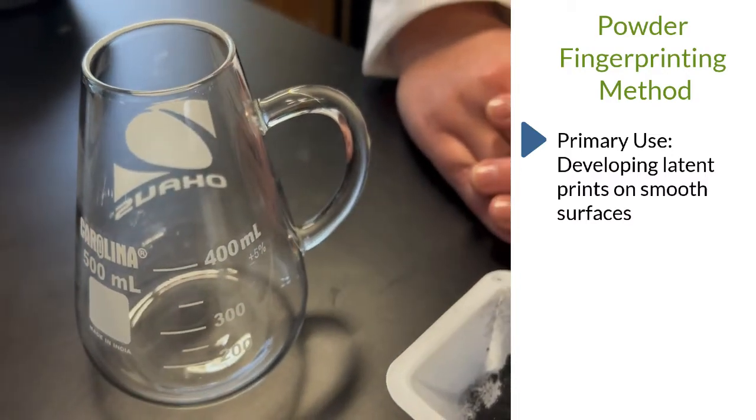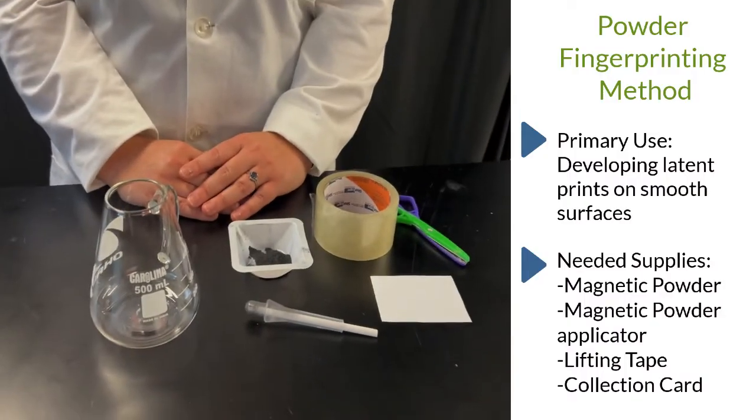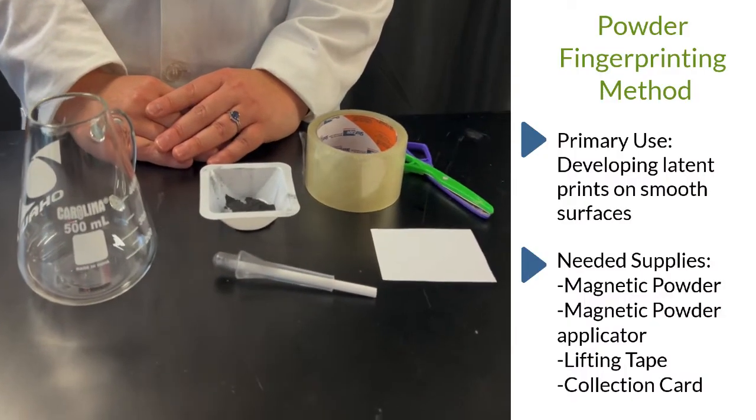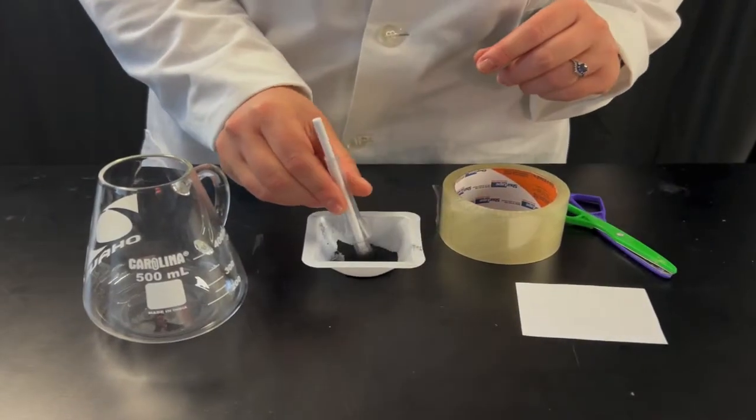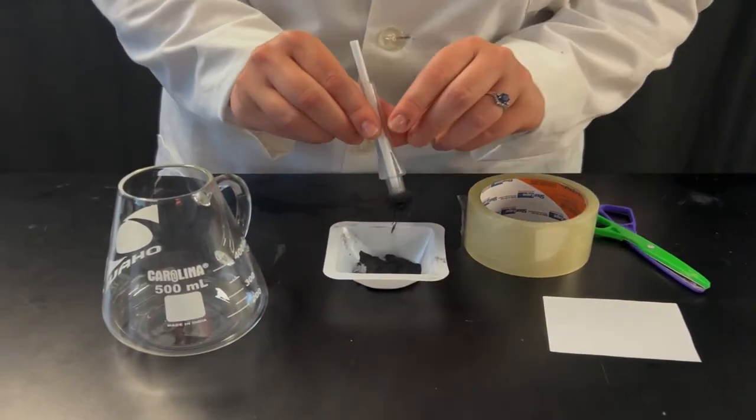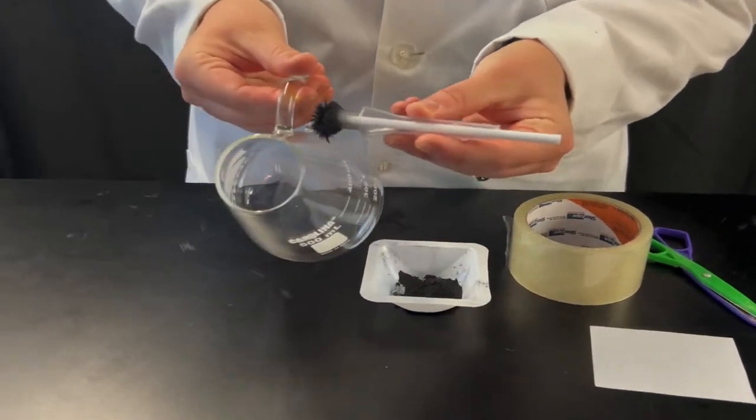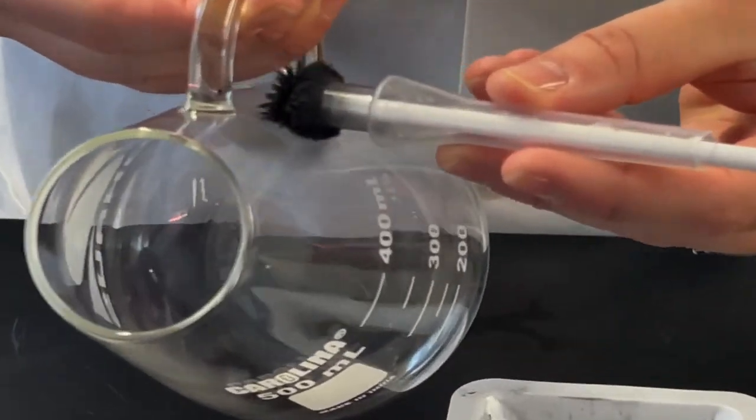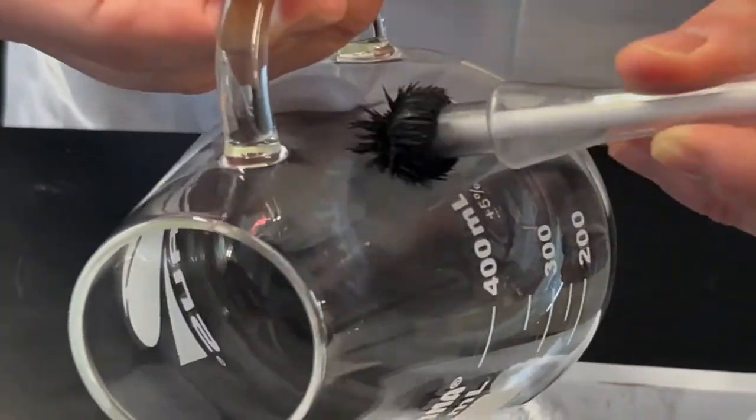To develop fingerprints with powders, you will need magnetic powder, a magnetic powder applicator, fingerprint lifting tape, and a collection card. To develop latent prints with powders, first obtain a magnetic powder applicator and draw a plume of magnetic powder. Now obtain your specimen with suspected prints and carefully sweep the powder over the surface. If latent prints are present, they will begin to become visible as they pick up the powder.